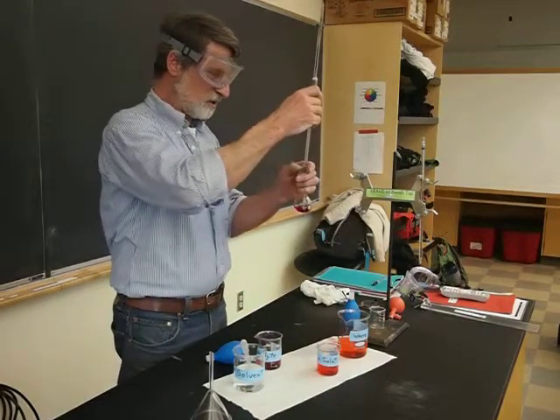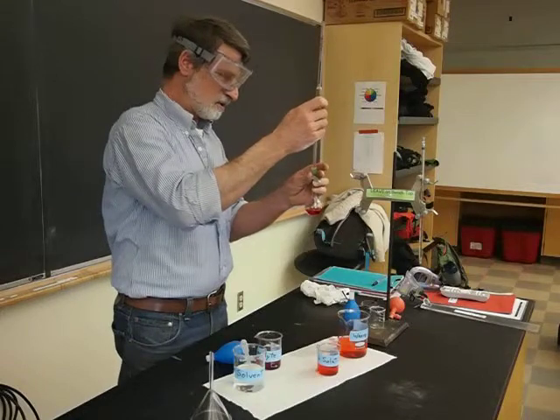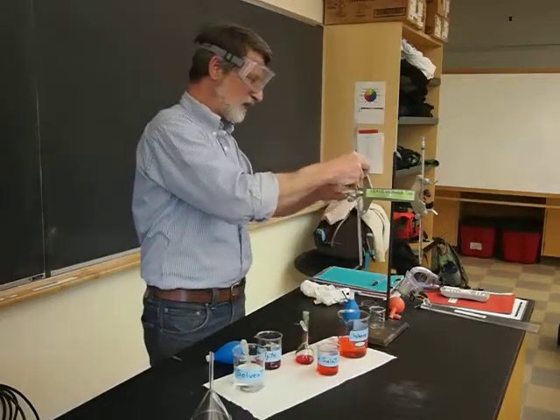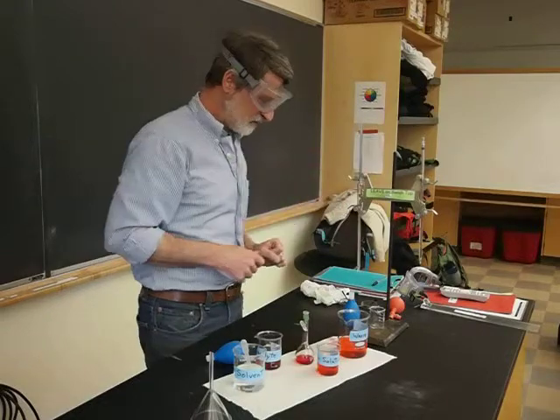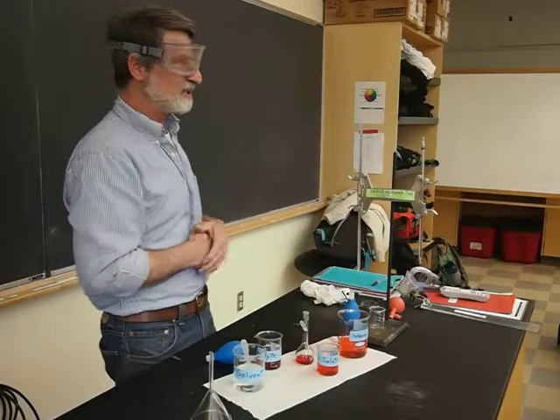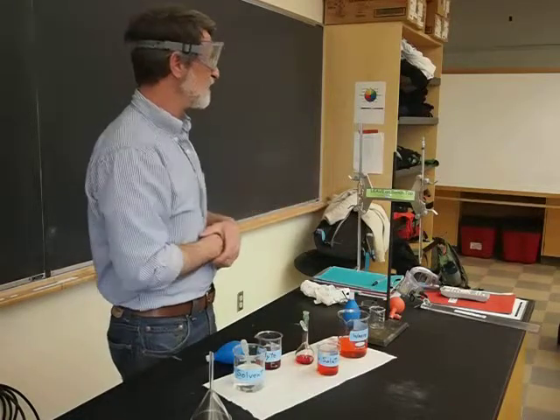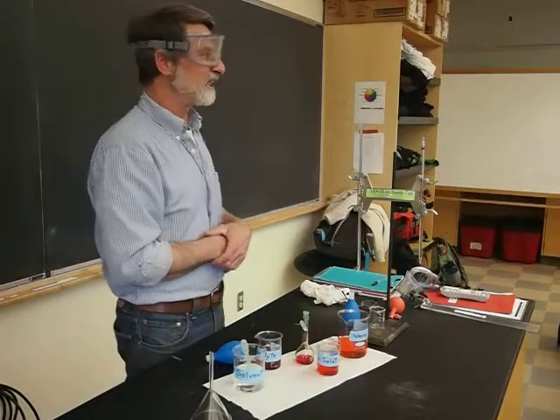Final note: don't touch the tip. Keep these things up in these clamps so they don't roll around and fall on the floor. They're quite expensive. These things are calibrated. That little line there is drawn by a person, not a machine.